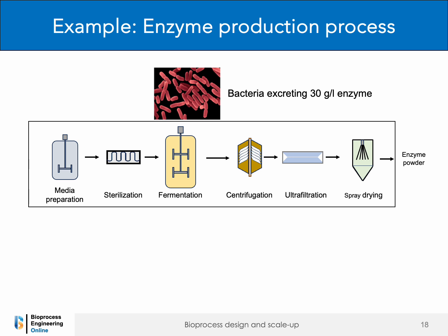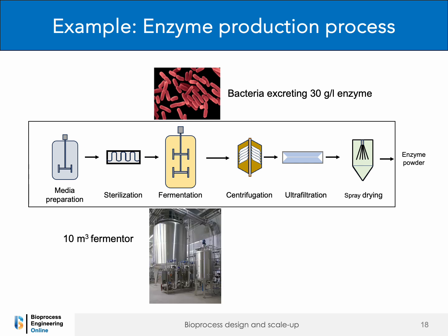The biotransformation employs bacteria, capable of excreting up to 30 grams per liter of enzymes. It is carried out within a 10 cubic meters fermenter. The production process comprises a total of 180 consecutive batches per year.